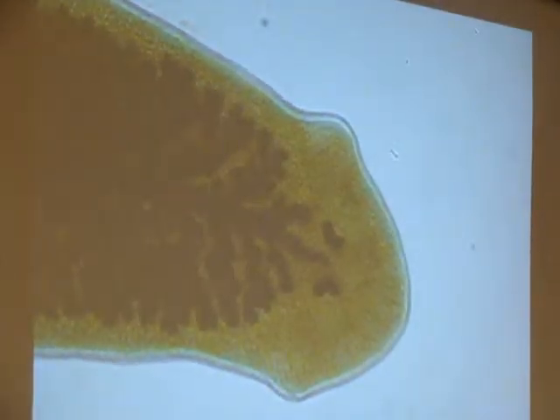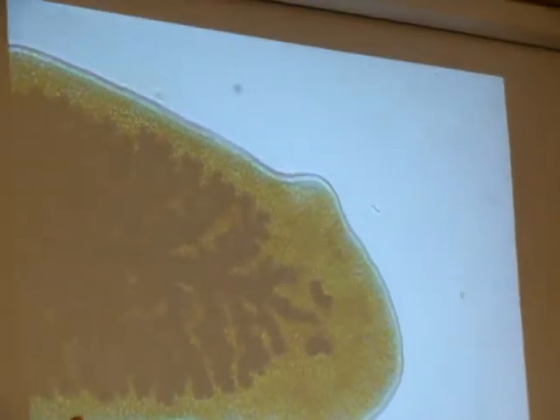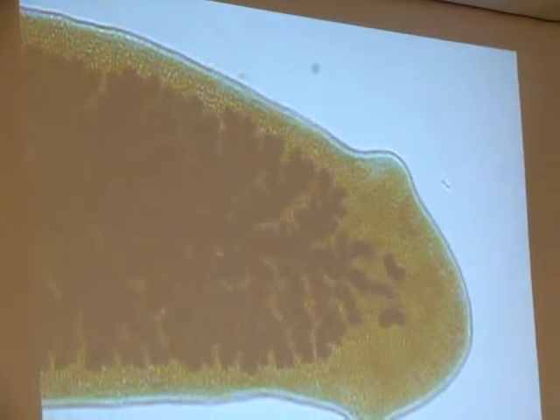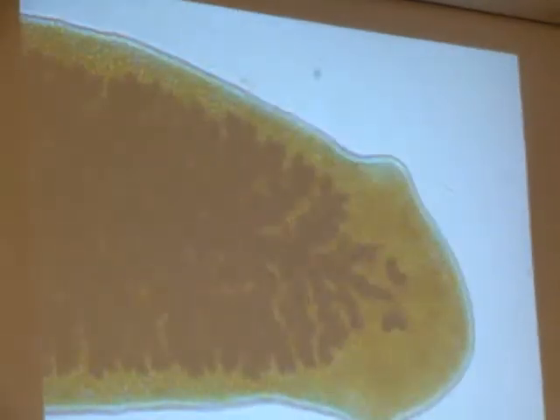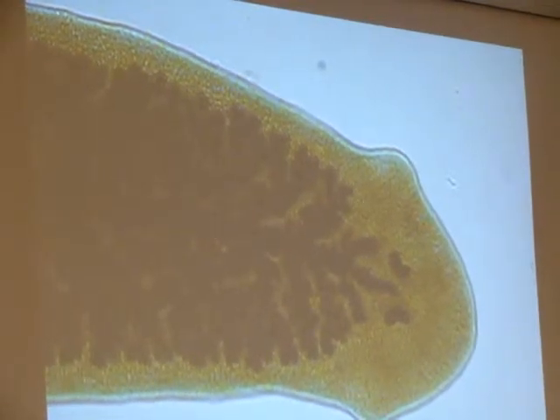The other page, that's a polyp. Name this organism. Oh, Trematoda? Turbellaria. Those are the two. So is this thing free living or a parasite? It's free living.